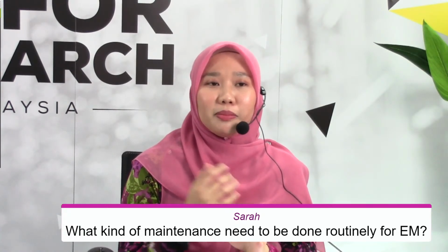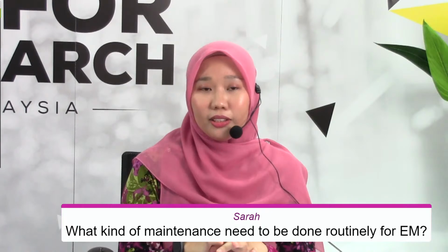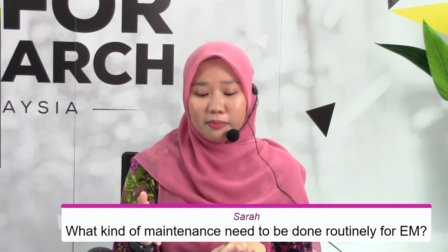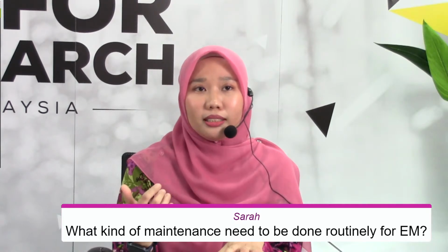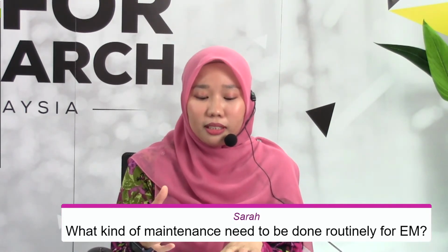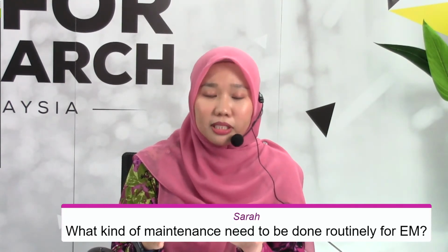So when it comes to the machine, of course maintenance is needed, and the machine is very expensive, so it requires very high maintenance. Usually the operator, the user, is responsible for adjusting the variable bias and the resolution inside the machine.